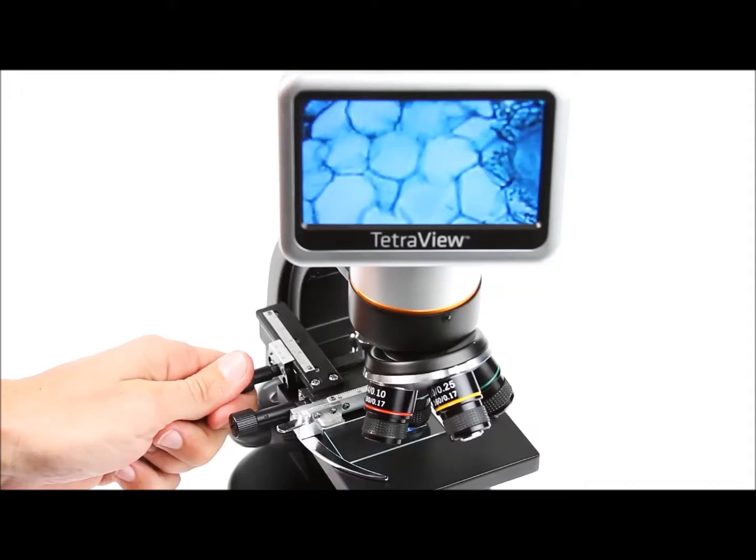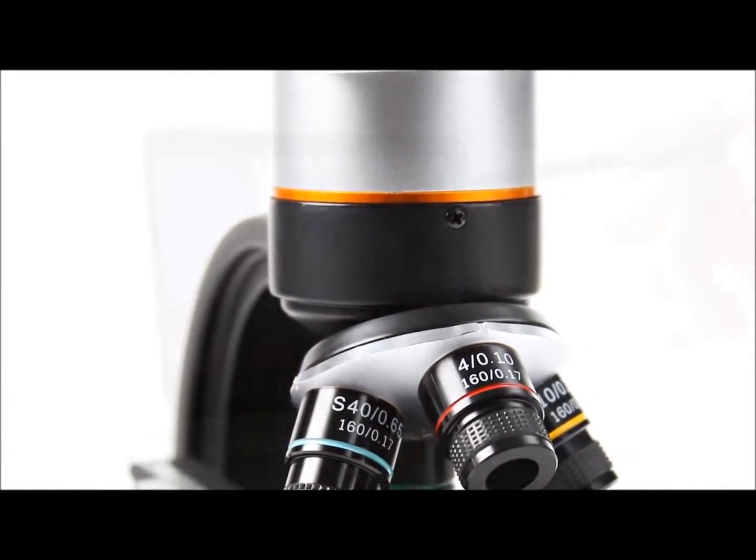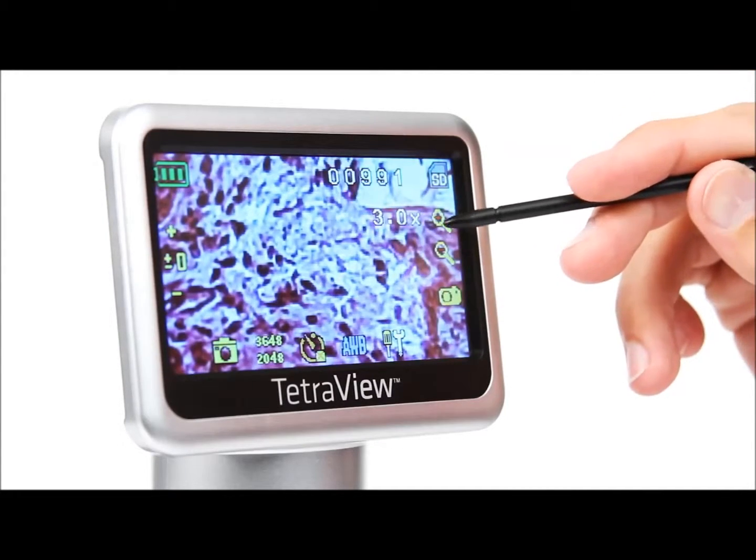This lab-quality microscope features 4 achromatic glass objectives on a rotating turret plus a 4x digital zoom, so you can achieve up to 1600x magnification.